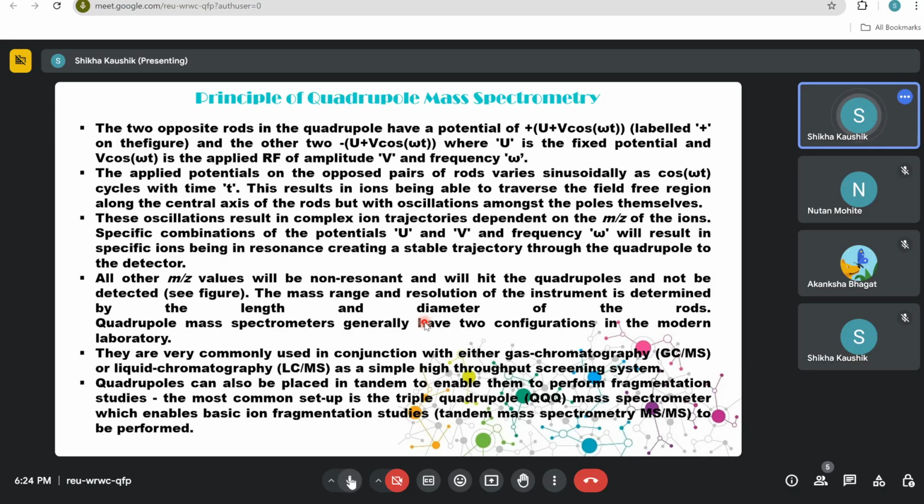Okay, so that's why I always say that whenever you are reading your proteome, it depends upon a lot of things. If some of the proteins are not getting converted into ions, they are unable to get fragmented and getting any charge, they will not be detected. So in case of targeted, you have known proteins.